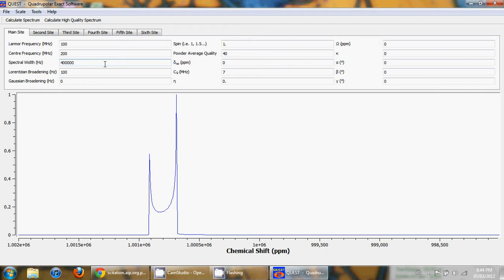So often the line shape from the NMR spectra is affected by the coil angle, and it seems that it's better to do these experiments in a coil parallel to the magnetic field instead of perpendicular.